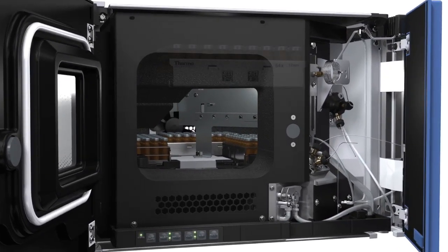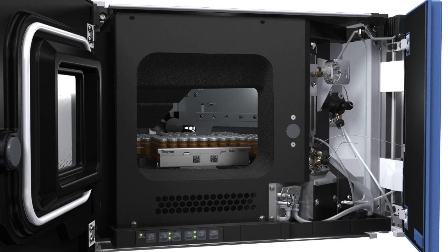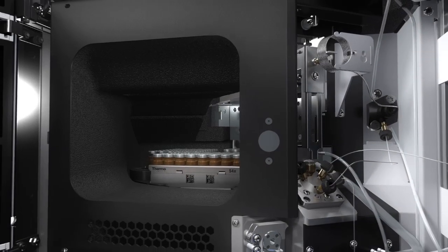Barcode reading integrated into the system and intelligent software allow for managing all these sample racks or well plates.